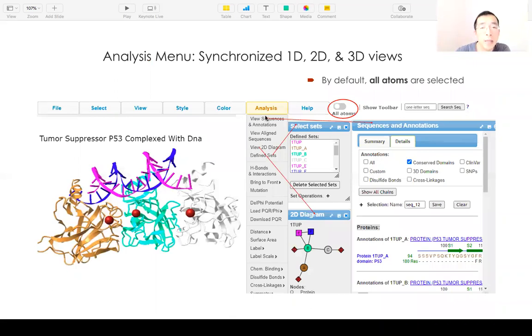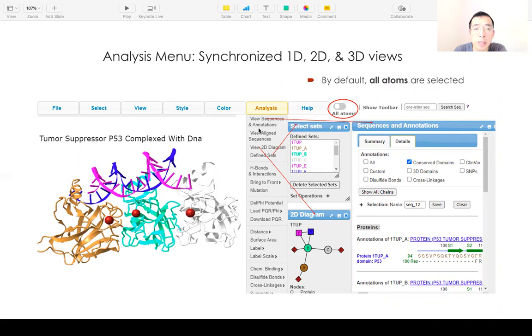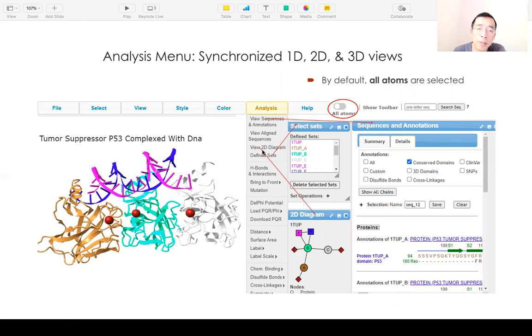In the analysis menu, there are many options to show sequence. Click 'Sequence and Annotations' to show the 1D sequence. If you click '2D Diagram', it shows the 2D diagram. You can also show the defined sets.